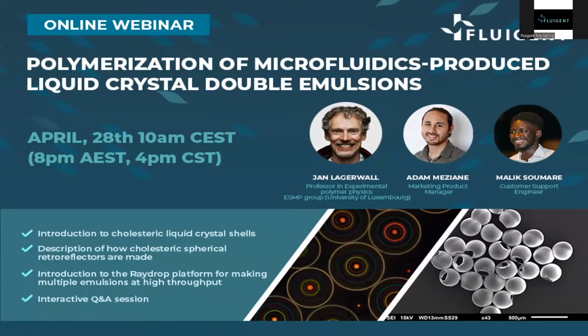And we have also Jan Lagawal from the University of Luxembourg, who will be presenting his work on liquid crystal double emulsion. He will make a presentation around his research field, introduce the cholesteric liquid crystal shell, the application around that. We will also after that introduce on our side the platform that we are using to make emulsion, and the platform that he is going to use in his experiment. And then we will switch to an interactive Q&A session.